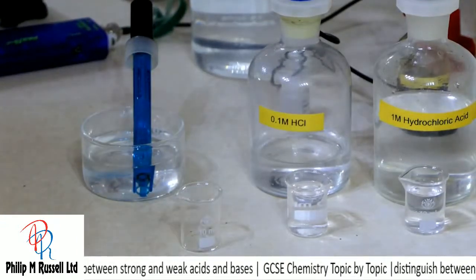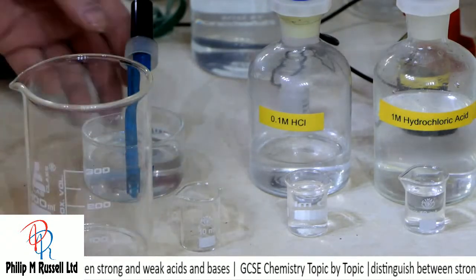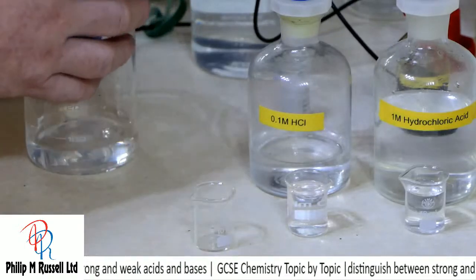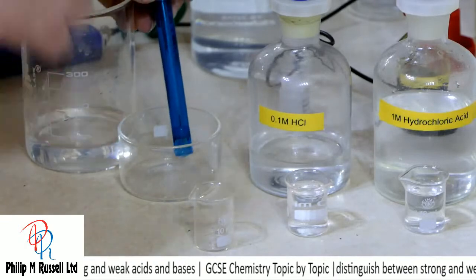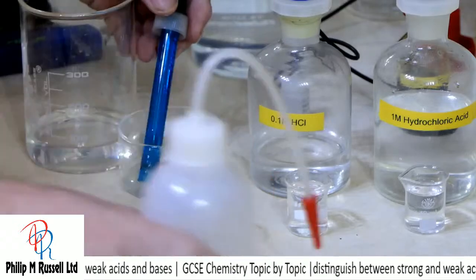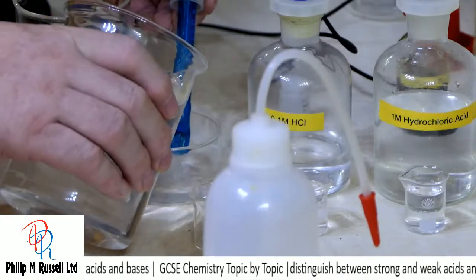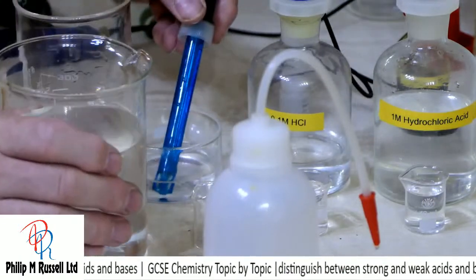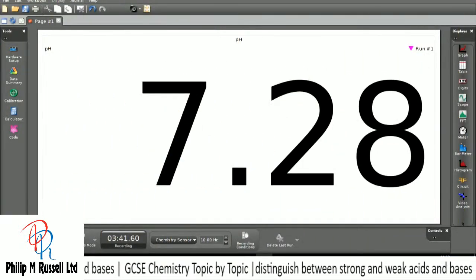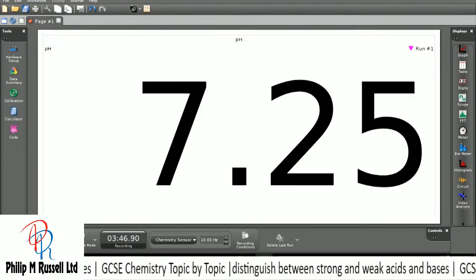So what I should do is just get rid of this water which I've used, and I've got some more distilled water here. Put that in there, and we're back to about 7. It's a little bit more. Odd considering it's the same amount of water I had, but still.